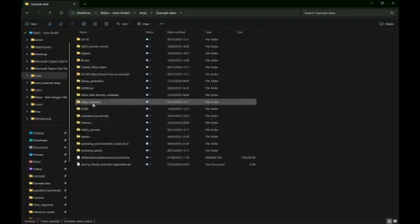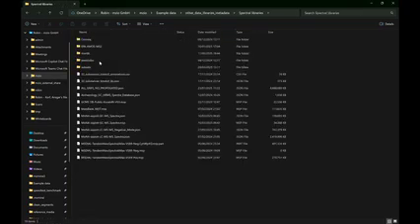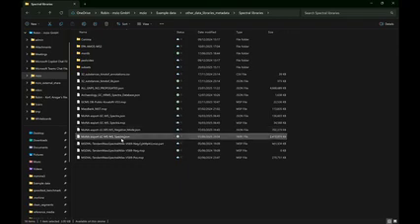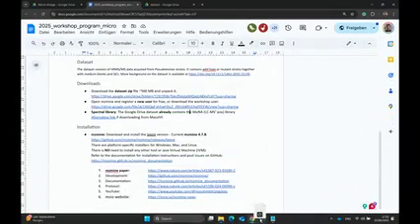For you, the library should be in the same folder as the dataset. You should have downloaded it, and if not, of course, then it's too late, but you can just go along without the library and it's still going to work. Let's see. This one, right? Okay, so it's a JSON library.